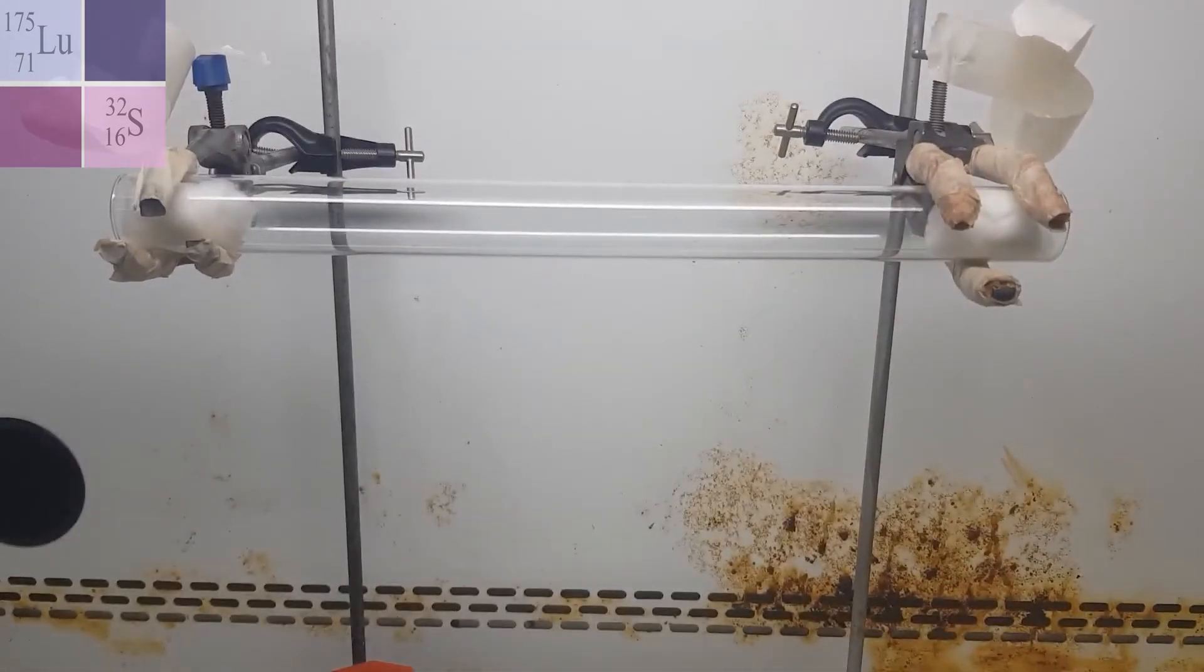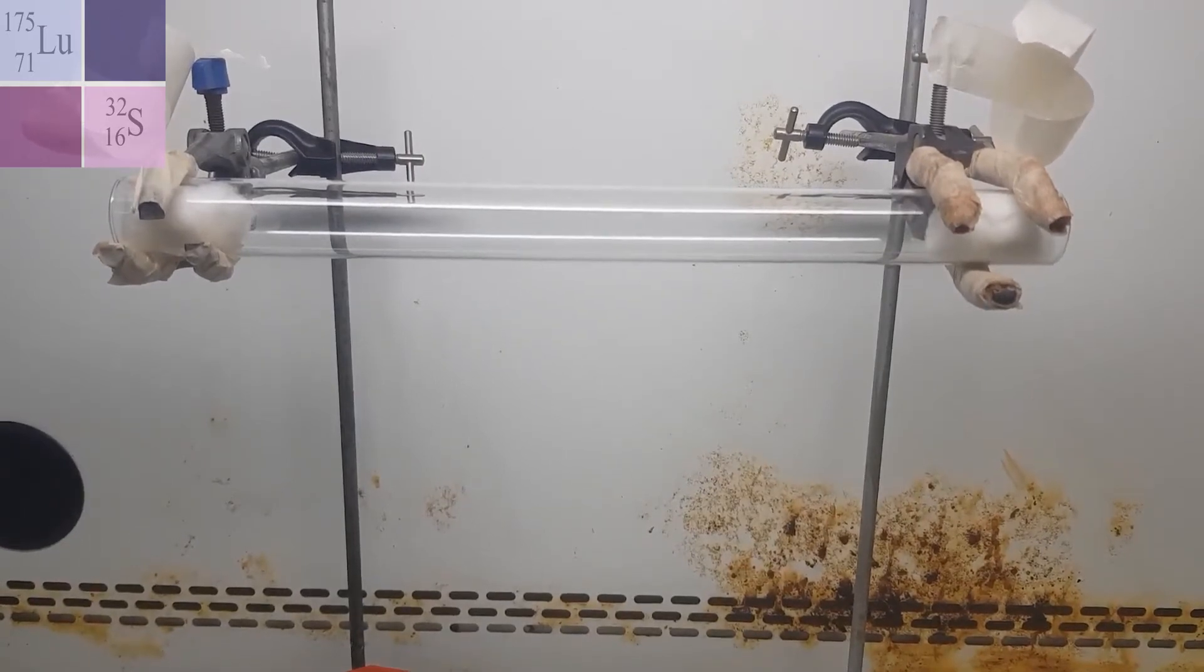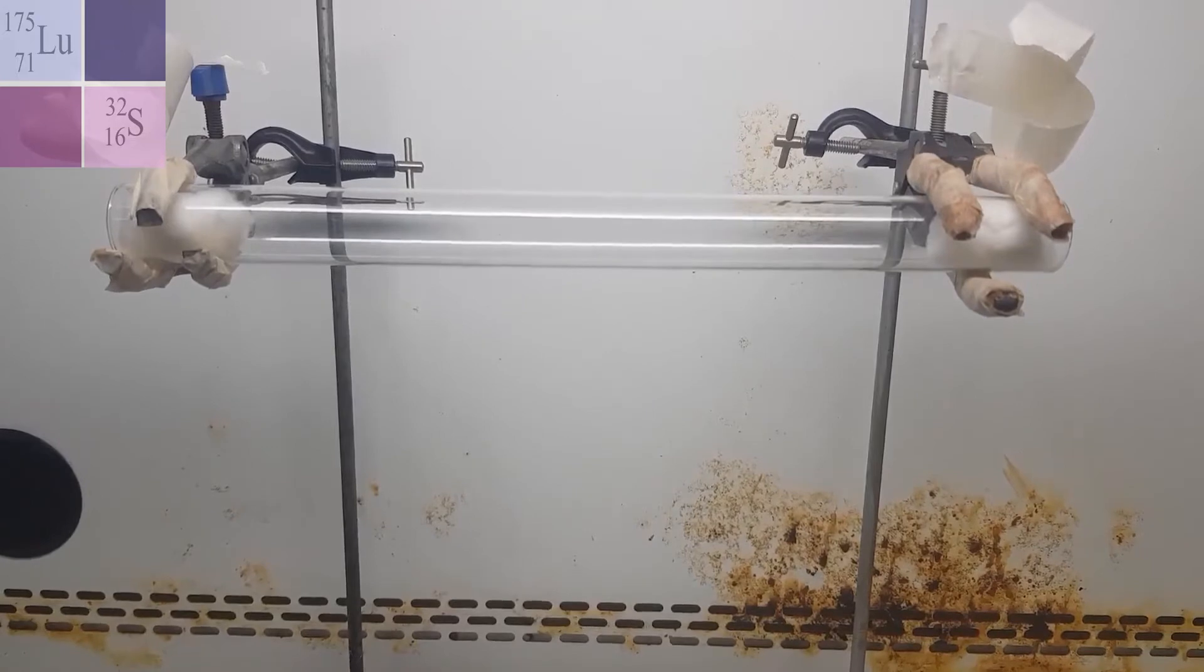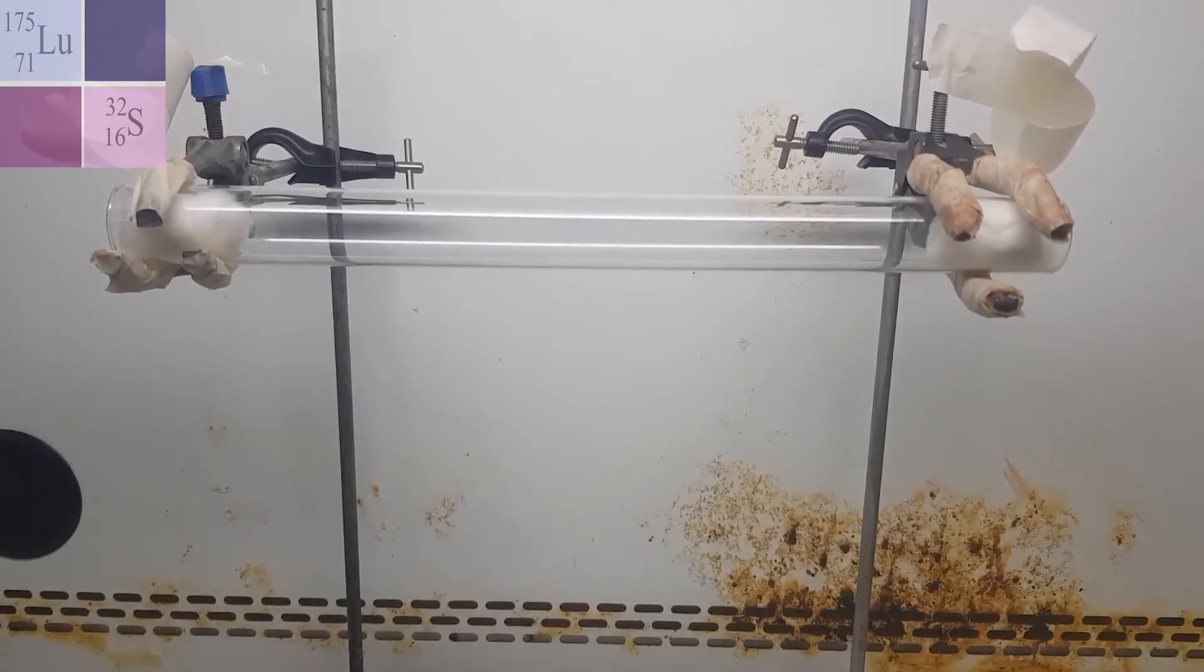So how will we tell when that happens? Well, when HCl combines with ammonia, a white solid is formed, ammonium chloride. So we should see that as a ring forming. Now, the ring will form closer to the side with the heavier gas. So that's what we're going to look out for.